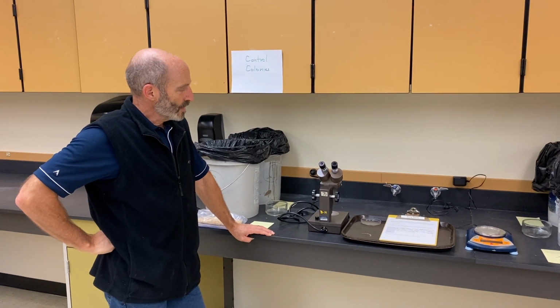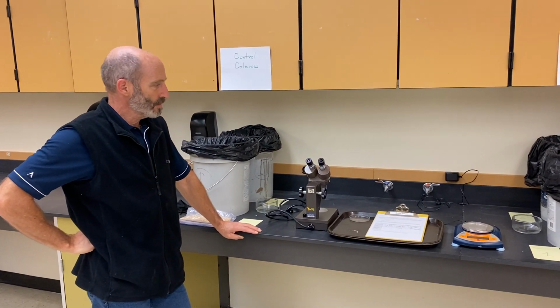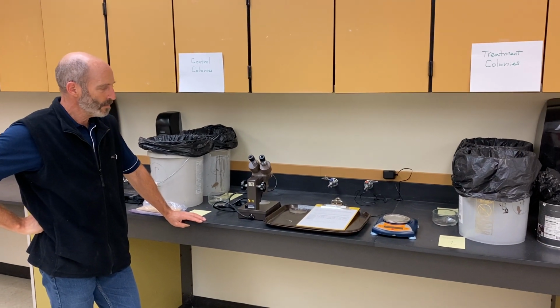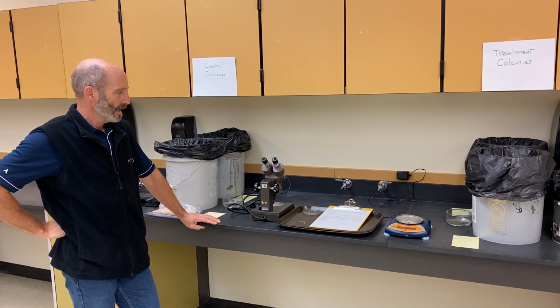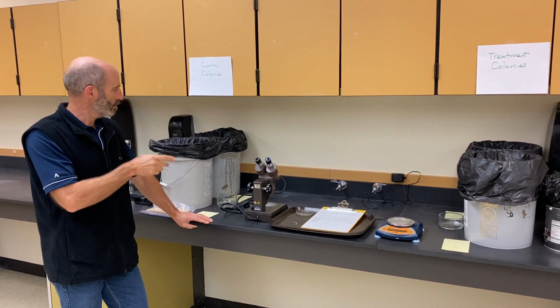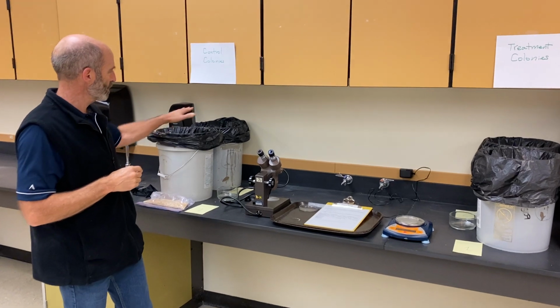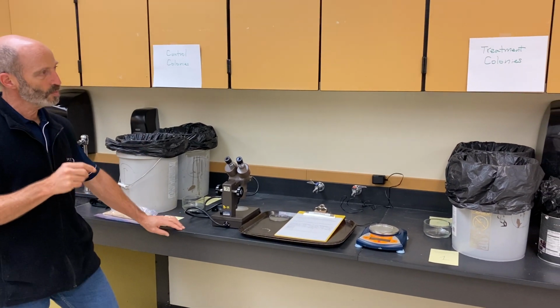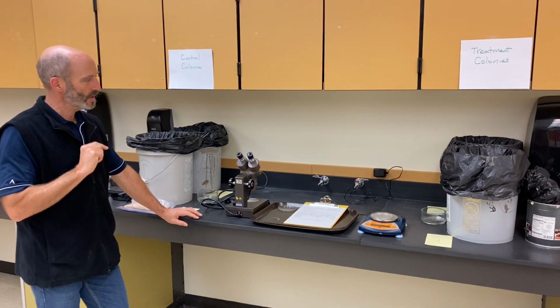All right, November the 25th is done in terms of the work that Mr. Brandon and I did to give you data 1 month after the setup of the lab. So you might remember in the first video that we had in fact scooped randomly 2 scoops from each one of the 2 buckets for the colony, control colony, 2 scoops per bucket for the treatment colonies.